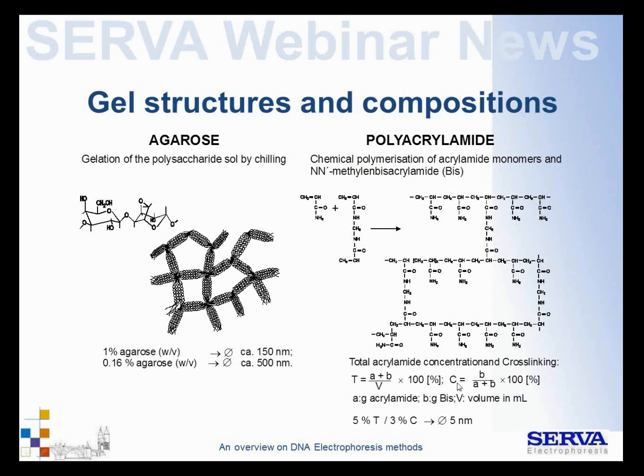You need to define it by a second parameter, which is the C value, the cross-linking factor, which in most cases is defined as a relative value: grams of bisacrylamide divided by the sum of acrylamide plus bisacrylamide. Please note that not everybody defines it in the same way.